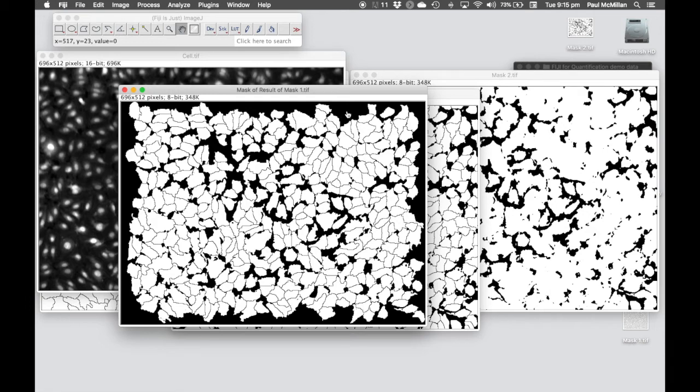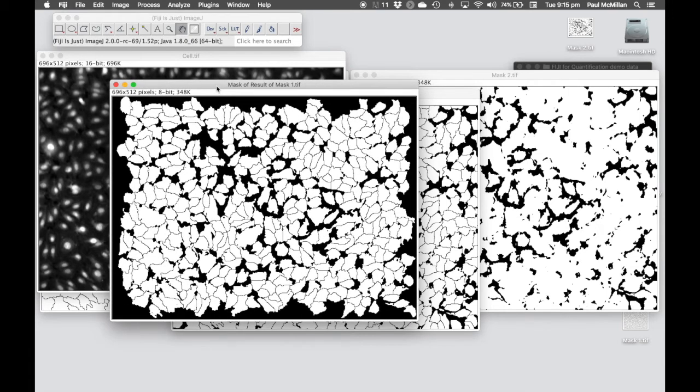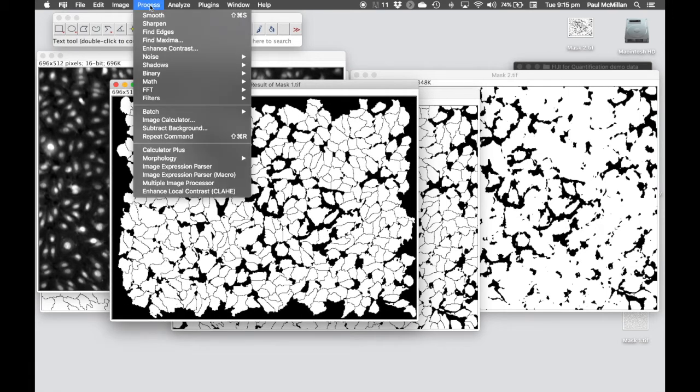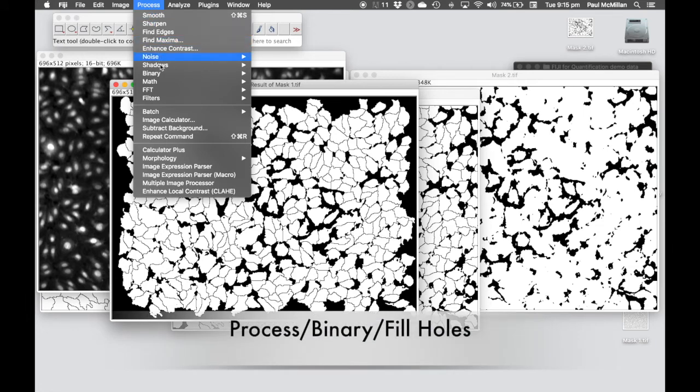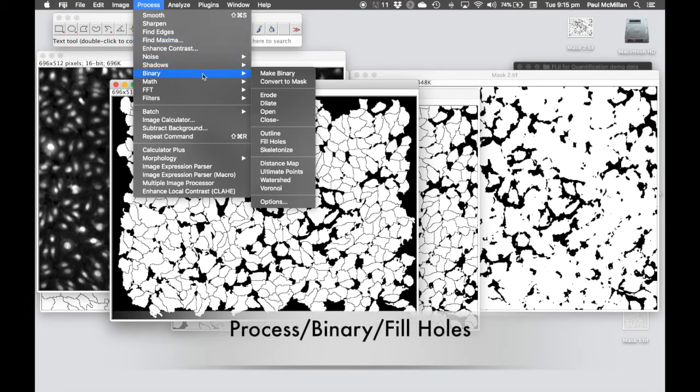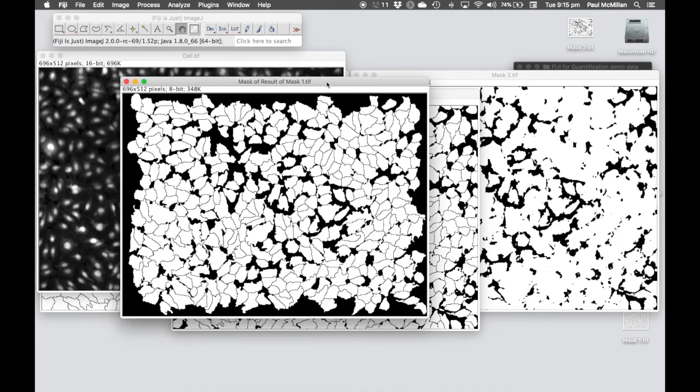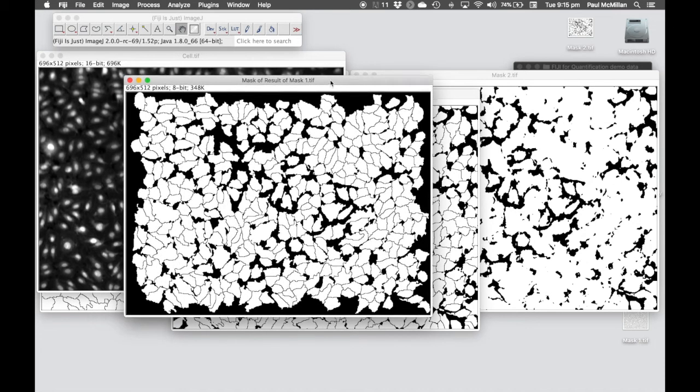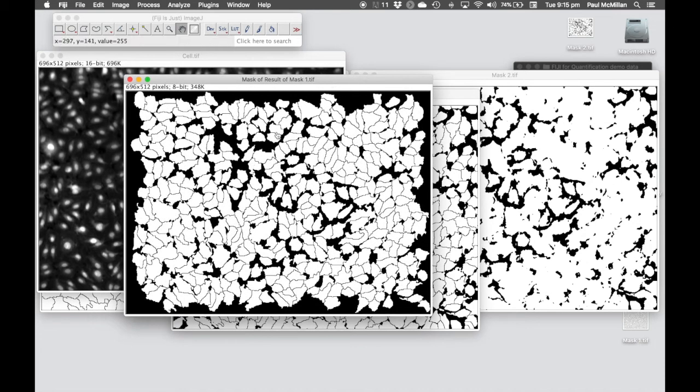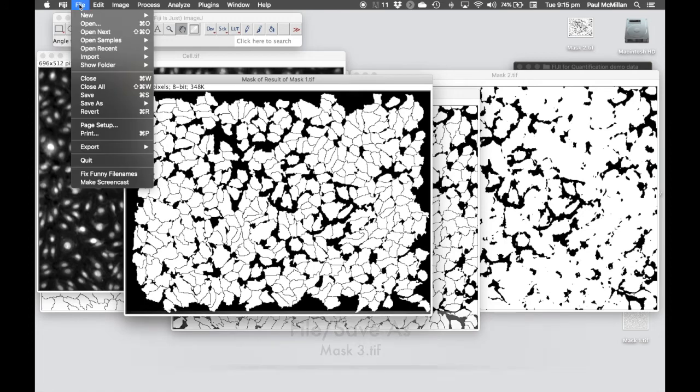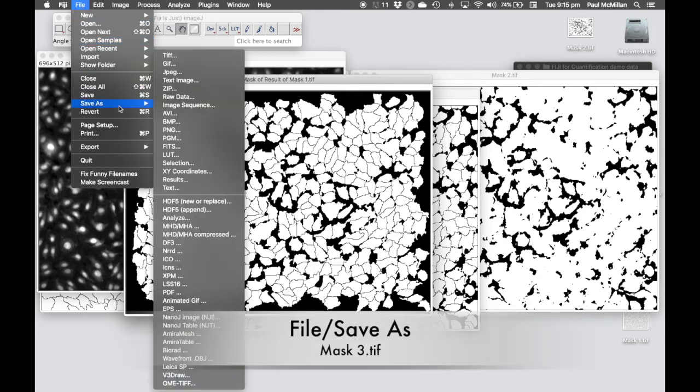The other thing we've got is a couple of cells in here, we've got little holes in them, so we want to fill those in. We want to measure the whole of the cell. We're going to go to Process Binary Fill Holes to do that. Hopefully you'll see those holes have disappeared. This is finally our final mask saying these are our cells, these are the regions that we want to analyze. Let's save this as mask3.